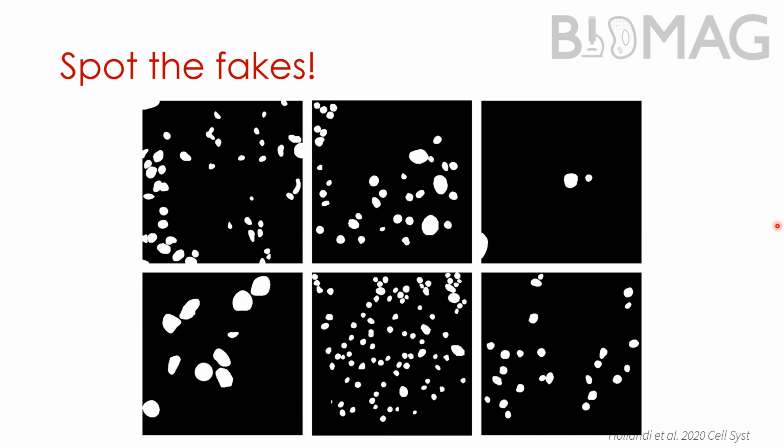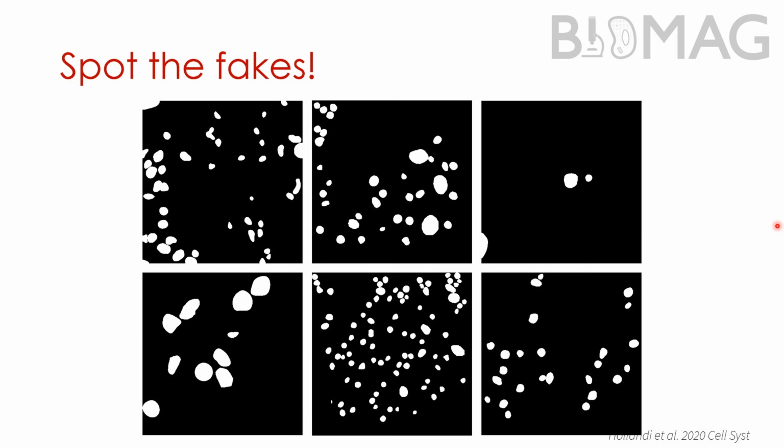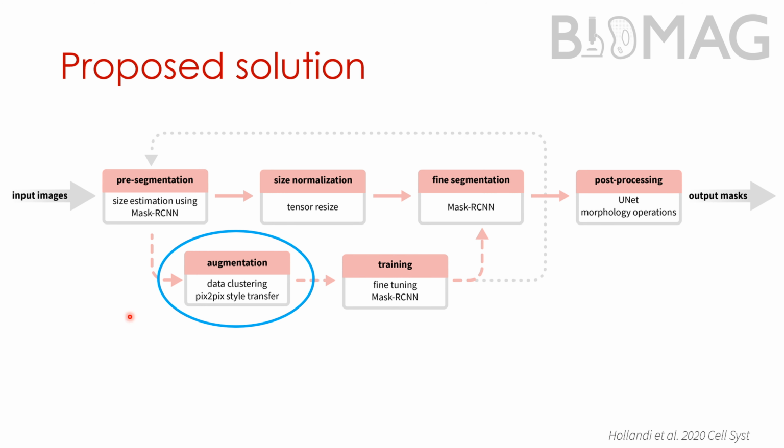We created these masks, as I just described, trained a separate model for each of them, and then applied them on these masks so that we can have these nice synthetic images, and we use them for training. So that's where we were.